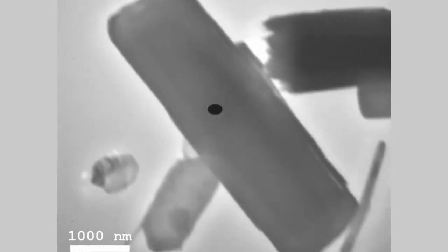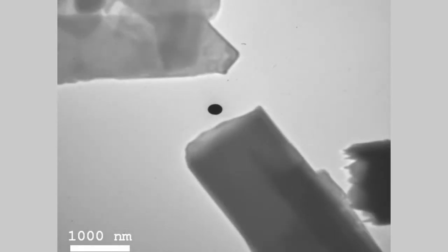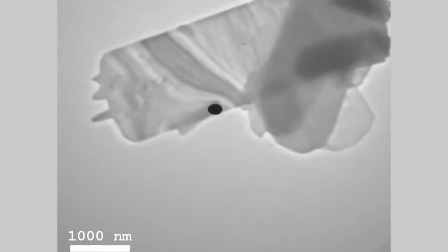So now I have a magnification of 4000. And the small pieces you see in the middle of the screen, that is the molybdenum trioxide crystals. So now I switch to the camera view, which you will see on the screen now. So the green has now become gray. And the black region here is the sample that's being observed. So this is the molybdenum trioxide crystal viewed in the TEM camera. What we have here is 4000 in magnification. And you can see with the scale bar on the screen that the width of this is almost 2 micrometer.